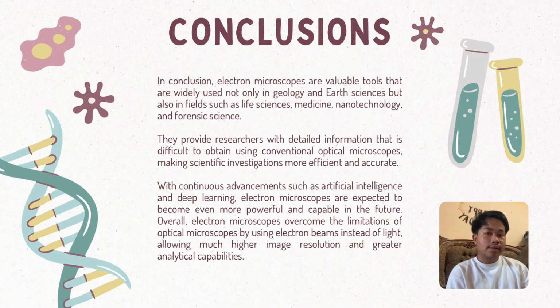Although it has some limitations, such as high cost and complex sample preparation, its advantages greatly outweigh these challenges. With continuous advancement in technology, including artificial intelligence and improved imaging systems, electron microscopy is expected to become more powerful and play an even greater role in future scientific research.